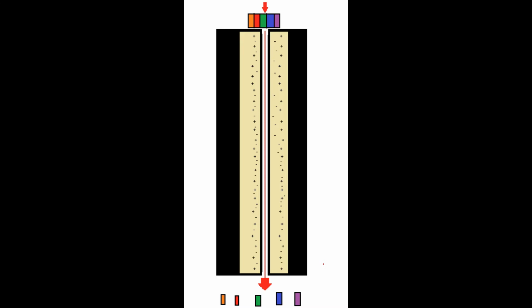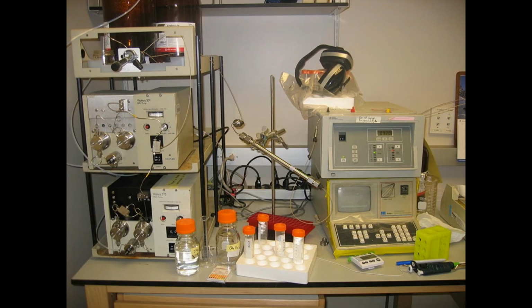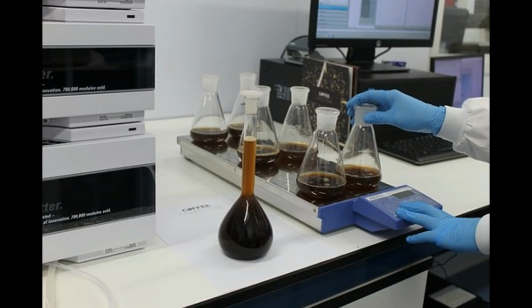These fractions eventually make it to the end of the cylinder, where it is either dumped as waste, put into a detection device, or placed into storage vials as a more pure isolate. The next stage after measurement can be the use of other detectors or a mass spectrometer. The machine can generate a timeline of when each product comes off the cylinder, and if a known compound is used as a control, it can then be measured against these results to produce a comparable plot.